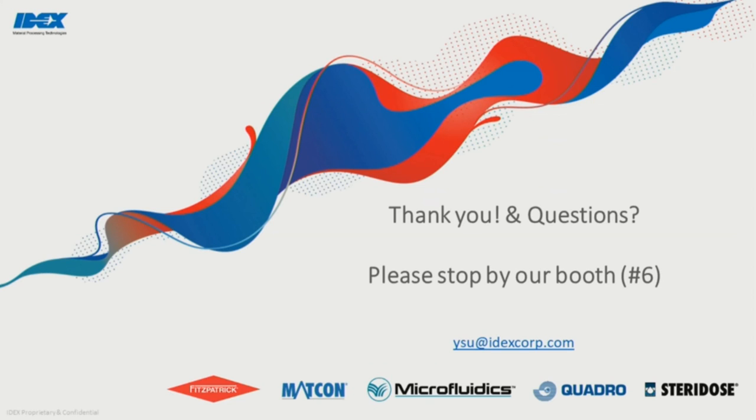Yes, there are a few different ways. There are a few parameters, especially pressure, that need to be adjusted. I didn't mention we also have different chamber designs, which have different dimensions for the microchannel. By combining the pressure and the microchannel design, we are able to achieve different shear forces. Based on our experience, we have some good ideas. Based on your formulation, we'll have a good starting point for you, but obviously there will be some optimization that needs to be done.